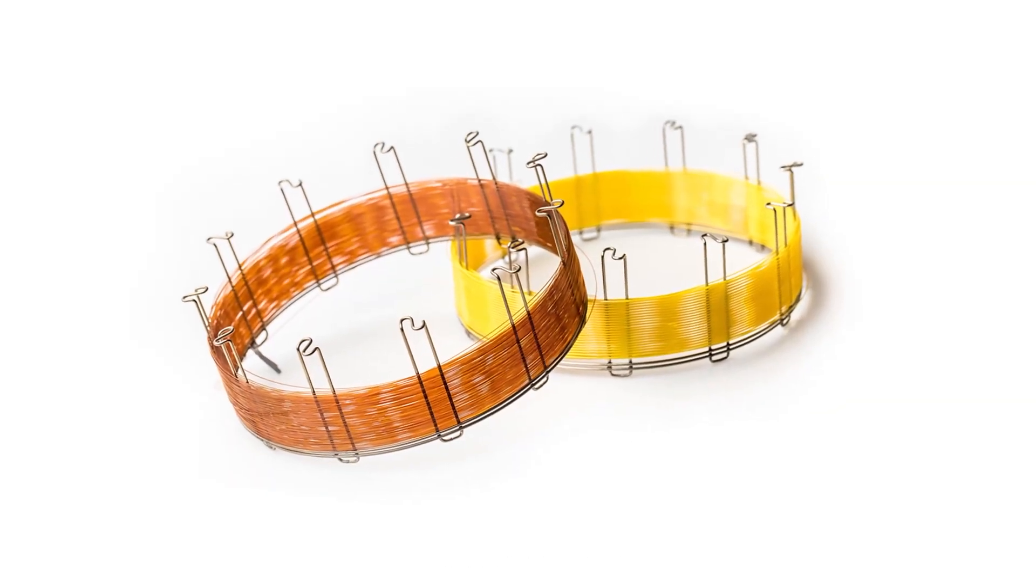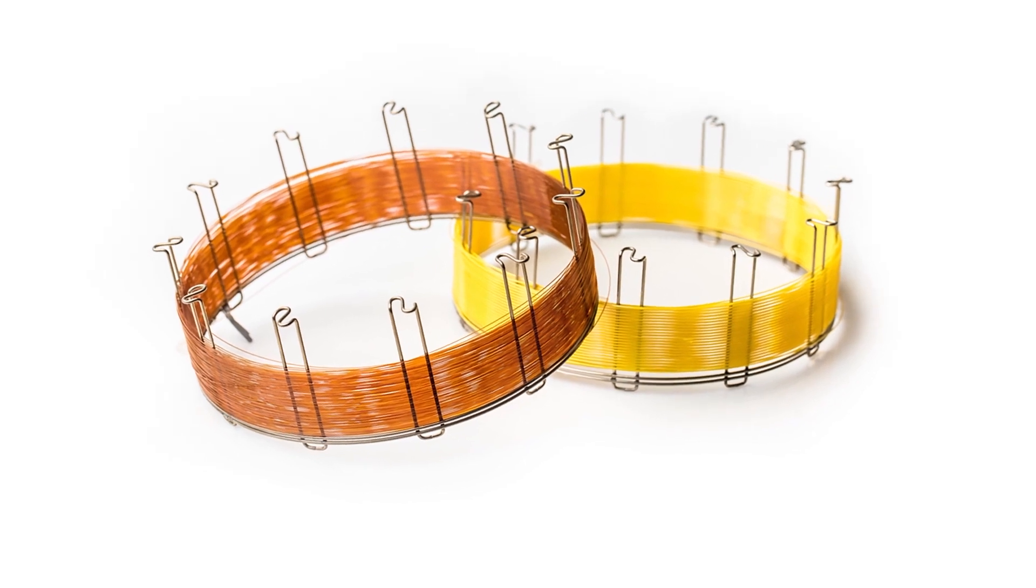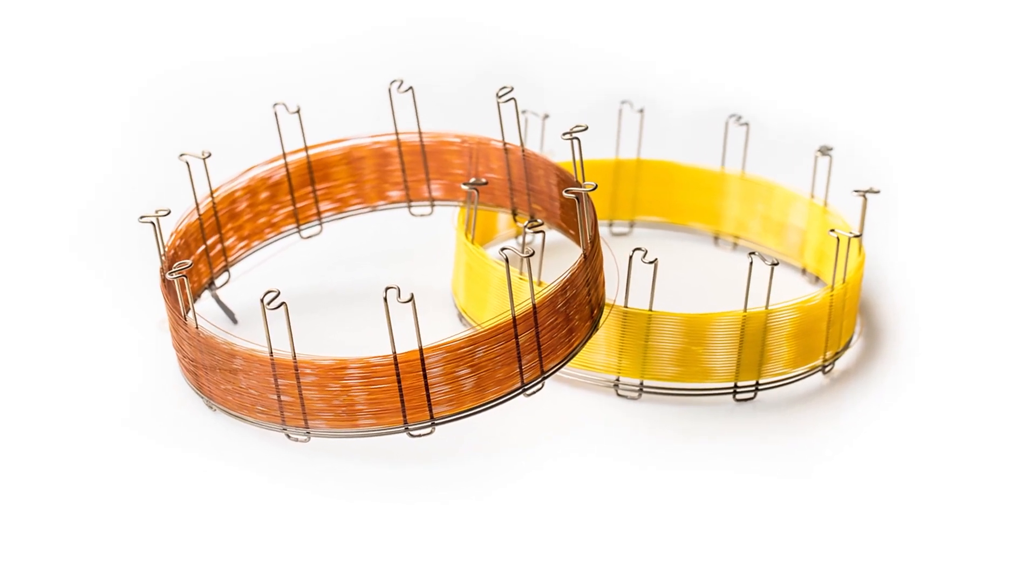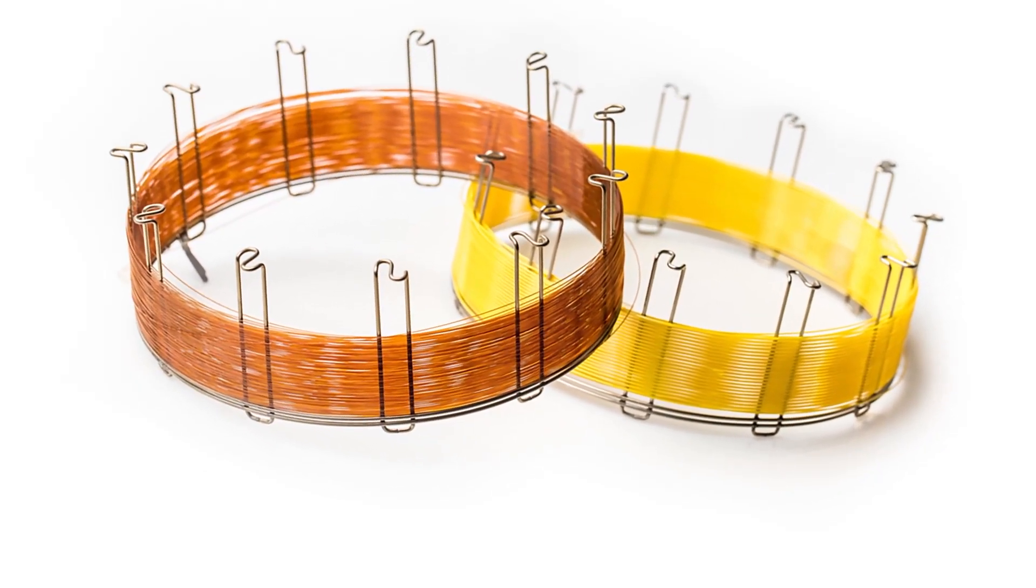Modern porous layer open tubular columns, or plot columns, offer incredible stability that minimizes particle release.